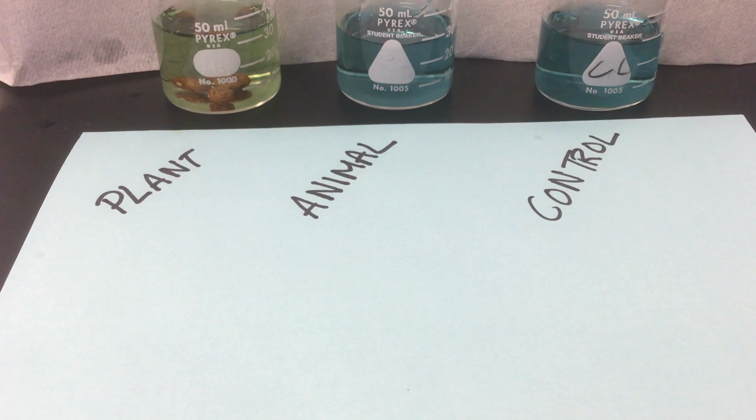So I really want to just make sure that it remains the color of the BTB all along. If it were to change and I didn't actually do anything to that beaker, then that would tell me that there might be some other variable at play here that's giving me the result that I'm seeing. So a control group is always important and always a good idea to include, if you can, in any sort of experiment.